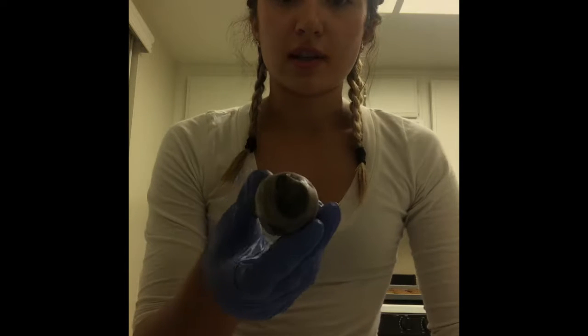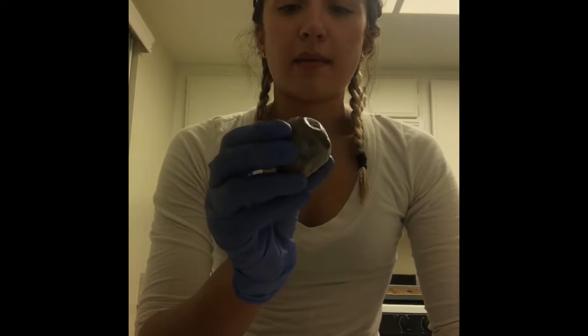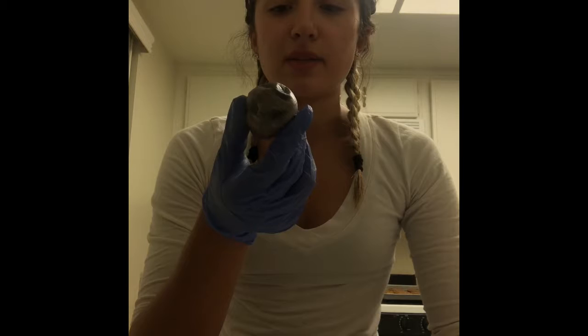So today I'm going to be describing several structures and features of the cow's eye that I find interesting. I've already washed the cow's eye right here, and I have taken off the excess muscle and skin.